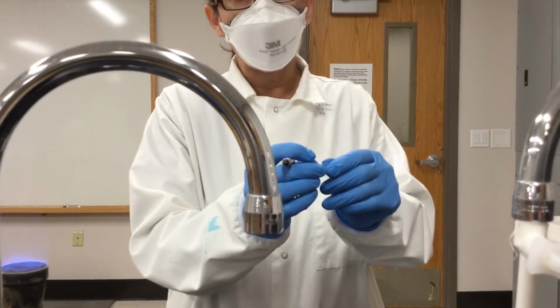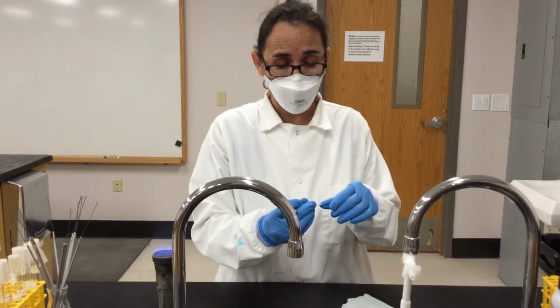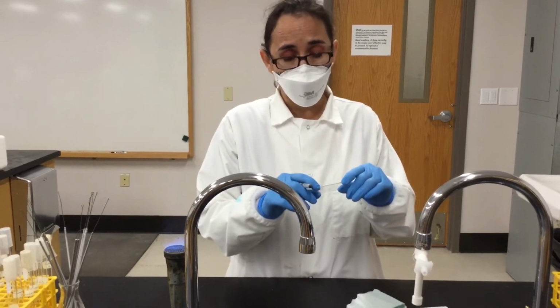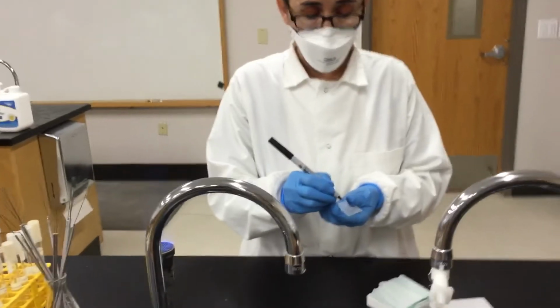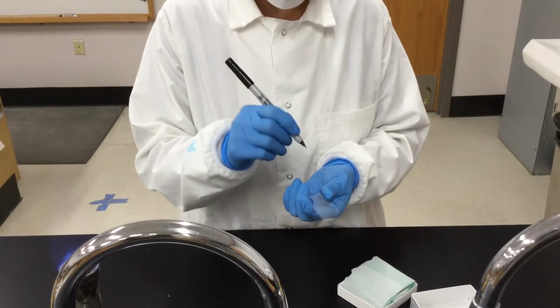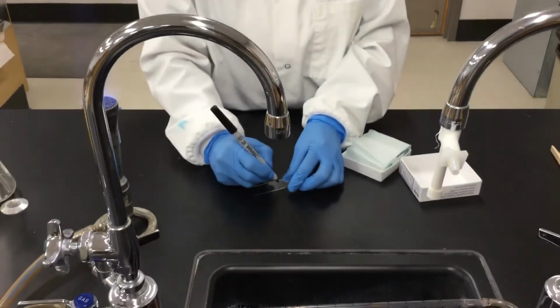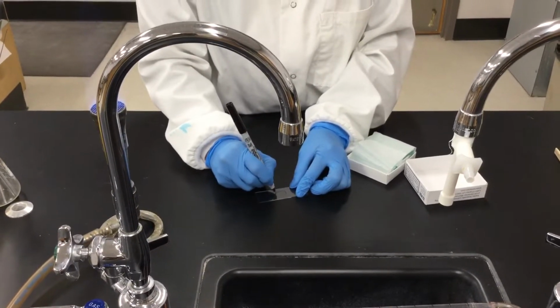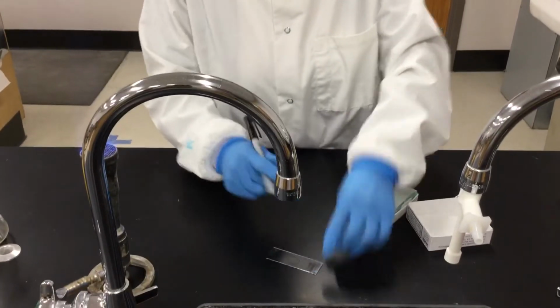Depending on what you are planning to do, sometimes it is advisable to label the bottom of the slide with a circle so you can identify where you have put your bacteria. So I'm going to do that, or you can do a couple of lines. I'm going to make this little circle, and it has to be on the bottom of the slide, not on the top.